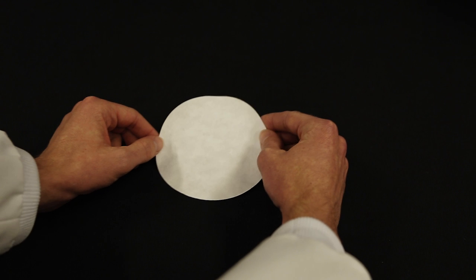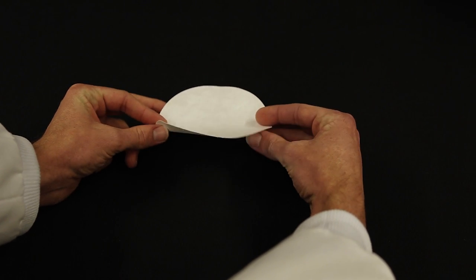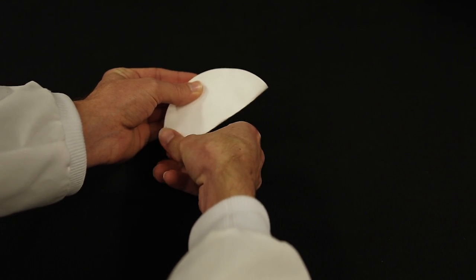Before beginning, pleat a filter paper for recrystallization. Take a piece of filter paper and fold it in half. Make a sharp crease.